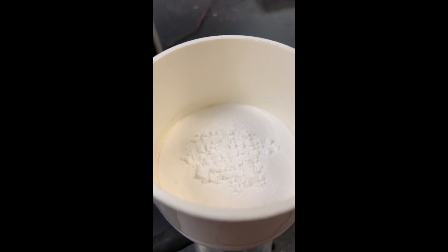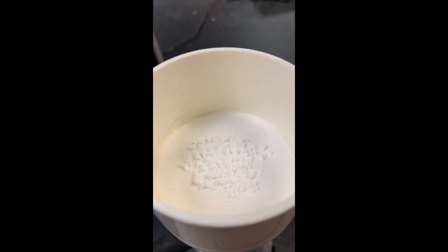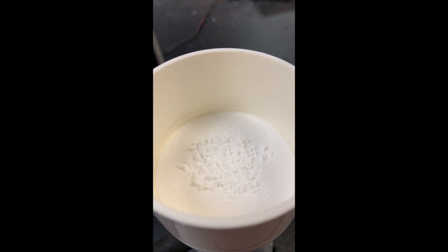So now I'm going to perform a phenol test on my synthesized aspirin and a crushed aspirin tablet that I just crushed with a mortar and pestle.